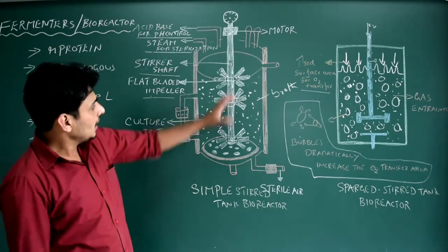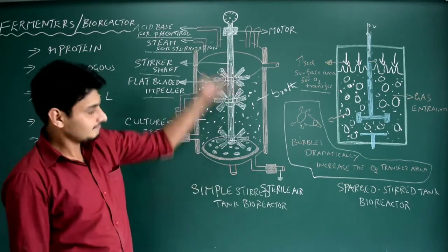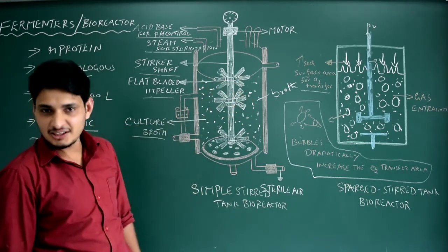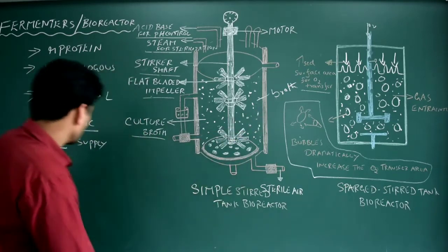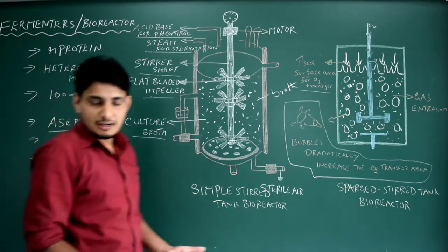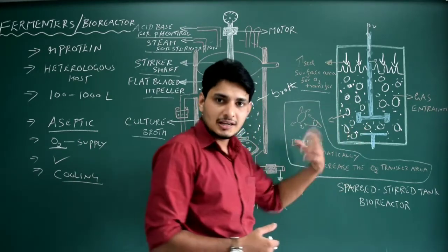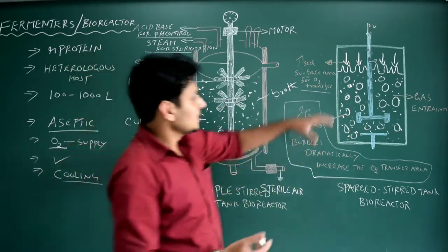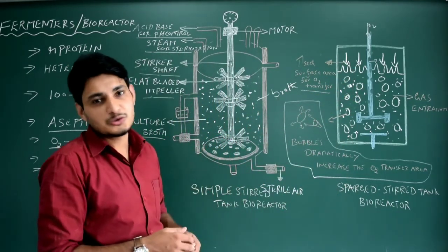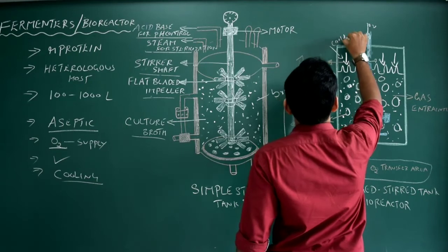What is the advantage of using fermenters? I have already told you, it facilitates the growth of the heterologous host organism because everything can be provided. Got it? One more challenge is cooling. I forgot. It is nothing but metabolism itself, right? Chemical reactions are occurring inside the vessel, the biofermenter. During that process, heat will be liberated and that will make this entire vessel very hot, and that could actually kill the heterologous host also. To avoid that, we need to supply cool water.